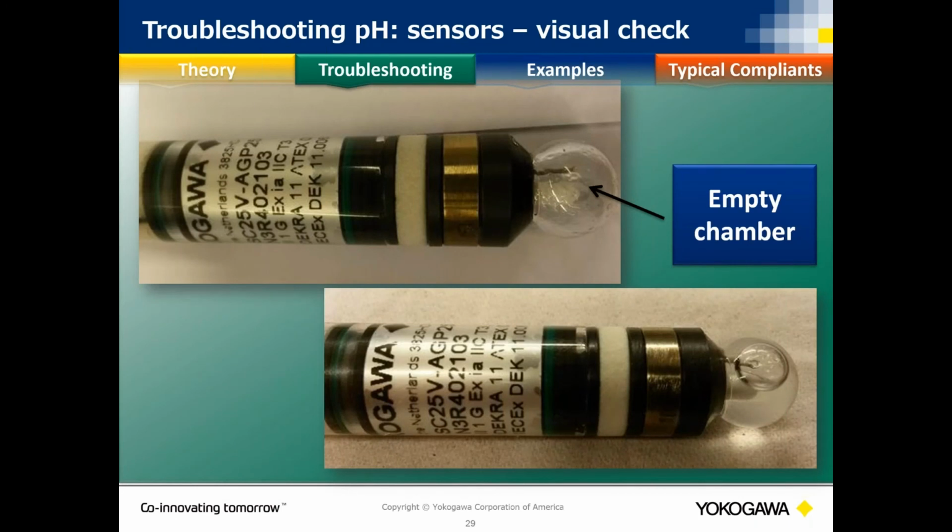My favorite one, another thing with gel electrodes. They're kind of a little pain, but manufacturers' boxes have arrows on the boxes with the recommendation for your storage, because you guys should all have one pH probe for the most part of your very critical processes sitting on your shelf in your plant that you can pull when your process sample goes down. Gels are notorious for this. Remember, gel expands and contracts with pressure and temperature. So when they fill the glass electrodes up, you have to leave a little bit of an air bubble in there so that the gel has someplace to go.